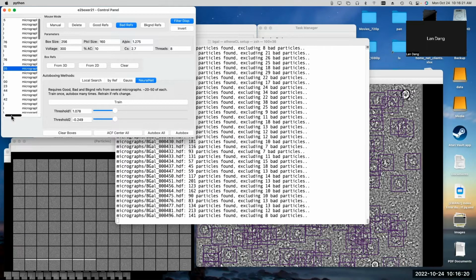It's often hard to train that second network well to recognize things like that as being bad, because it looks so much like a particle in many ways. It's a convolutional network, so it's basically learning what particles are based on their texture, and the texture of this isn't actually so much different than the texture of a particle. So that second network is actually pretty challenging to train.